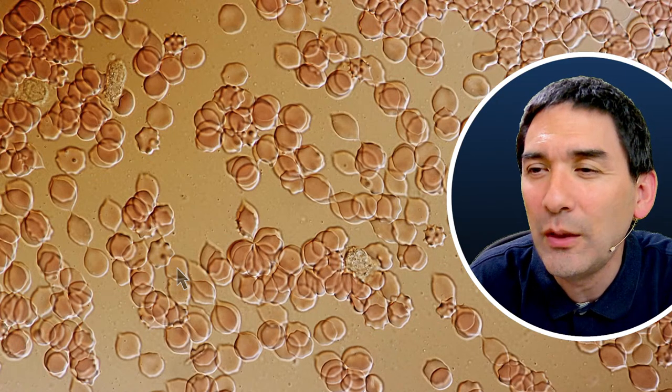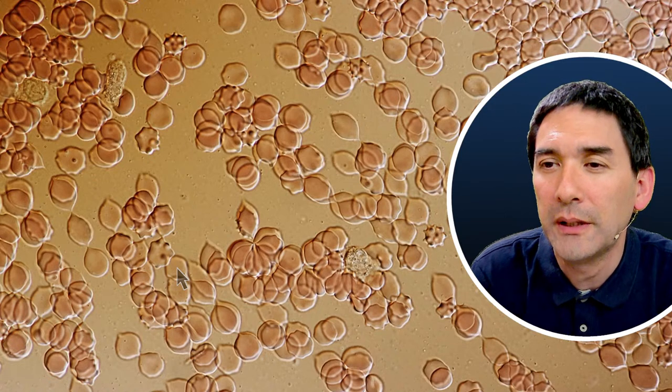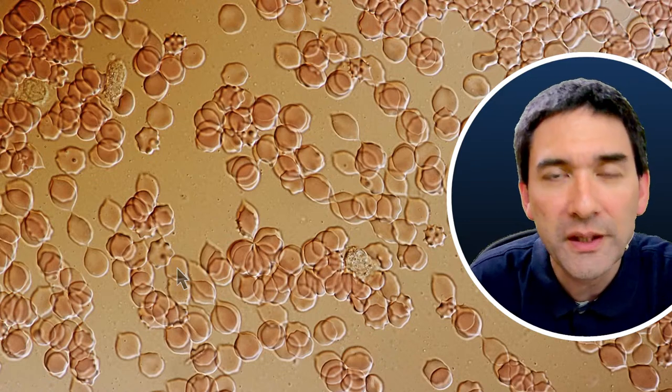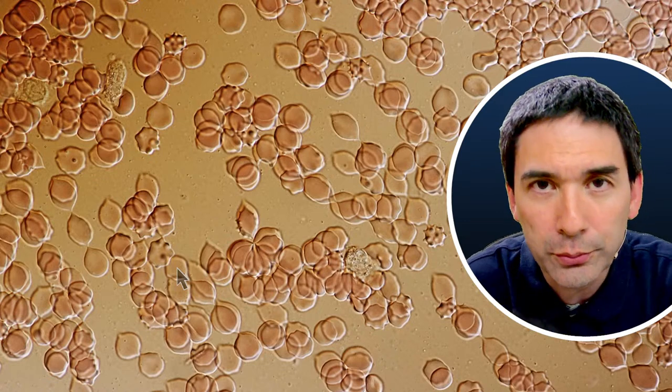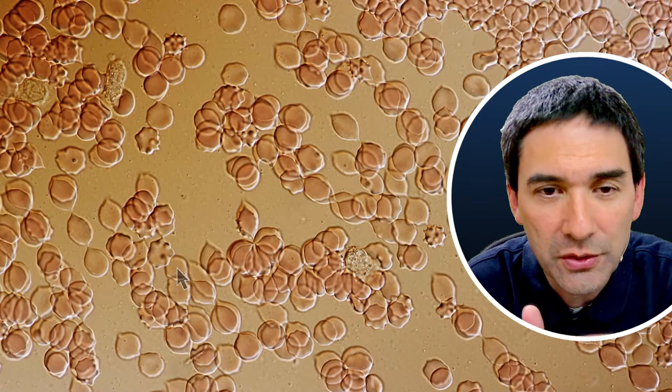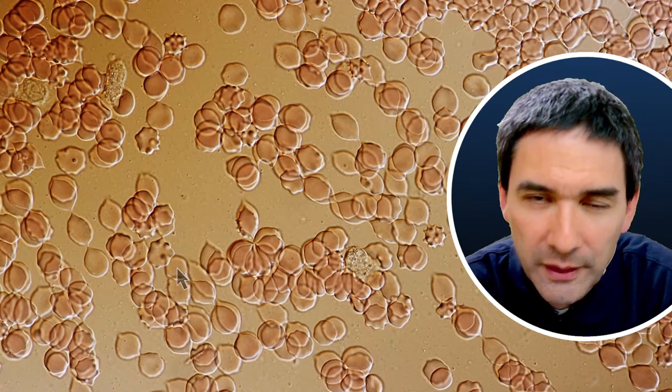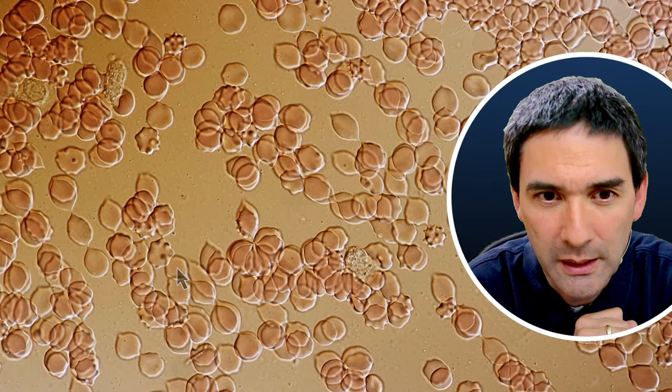Why didn't I see the white blood cells in the commercial prepared blood slides? Okay, that's an interesting one. I would assume that they are there, but maybe they were not properly stained, number one. And number two, there are much fewer white blood cells than red blood cells. So maybe if I were to look for them, then maybe you're going to find them.